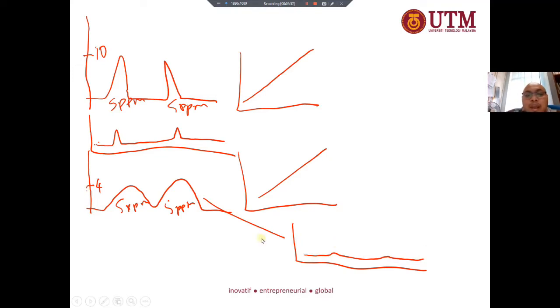So that's why we need to have a column or analysis with high efficiency. When you are doing your calibration curve, you can go to the ppb level, instead of here, where maybe you can only go to the ppm level. So you need to have a very good efficiency.